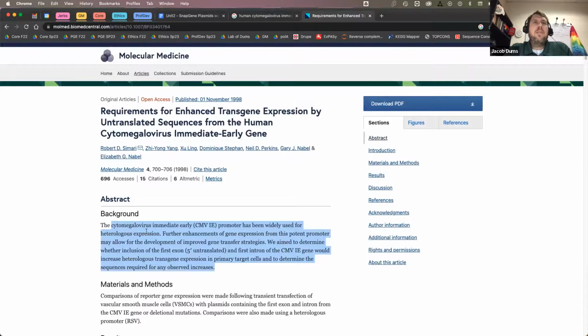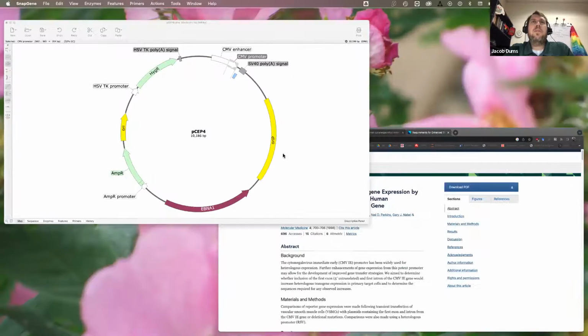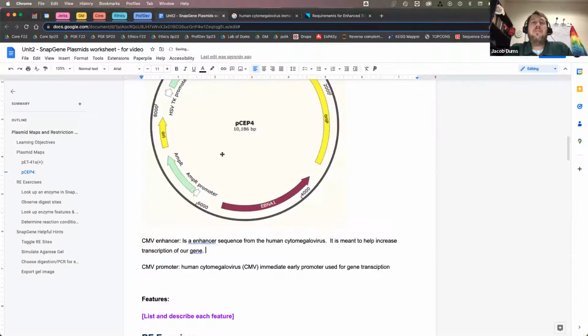All right. Looks like this is a promoter that's used just for stable expression, which is sometimes useful information to know about what you're working on, especially if you want to use that to manipulate something. Used for constant gene transcription.